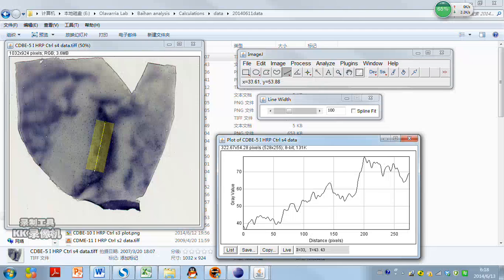The gray value shows the darkness and whiteness, so if there is a patch, we expect some lighter areas and then darker areas, so we are supposed to have waves. If there are more waves, the curve will be longer, right? If it's longer, then the PI will be bigger. Alright, so that's our definition for that.